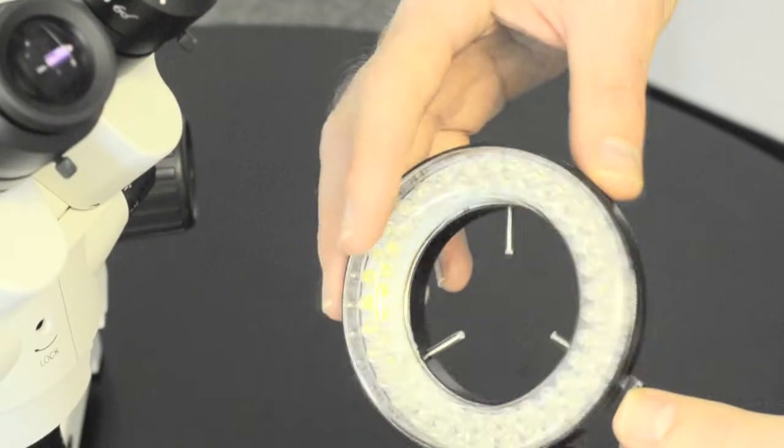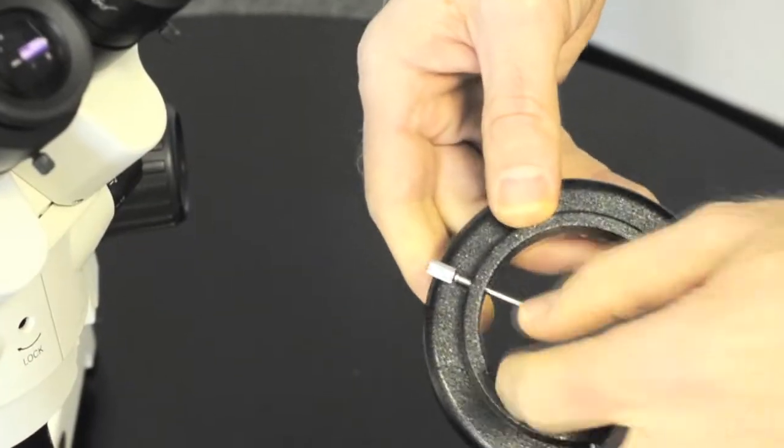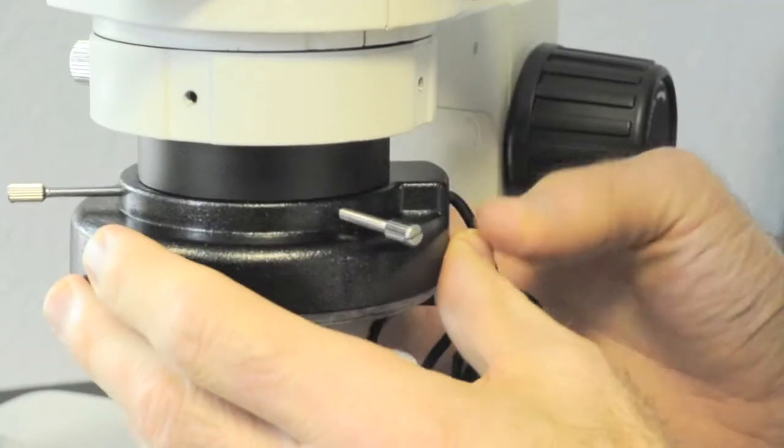There is an available 80 LED ring light which is a great lighting option for many applications. The unit attaches to the microscope head using three integrated thumb screws.